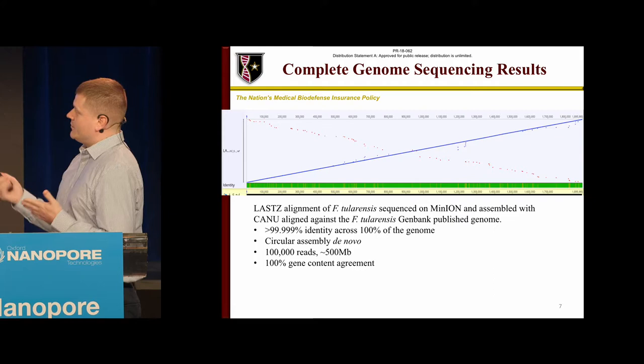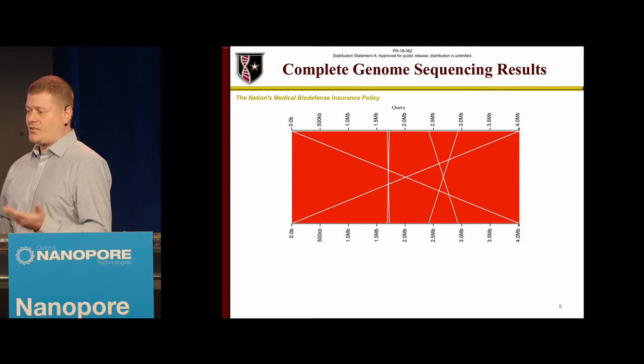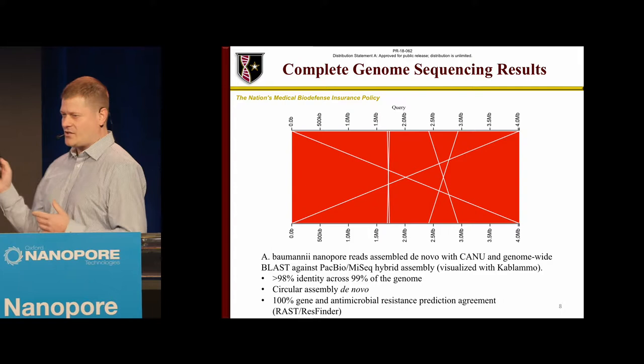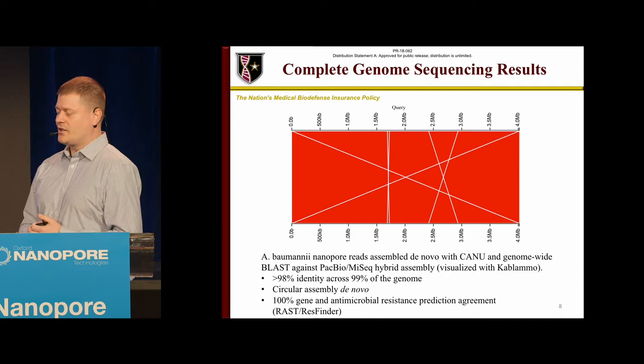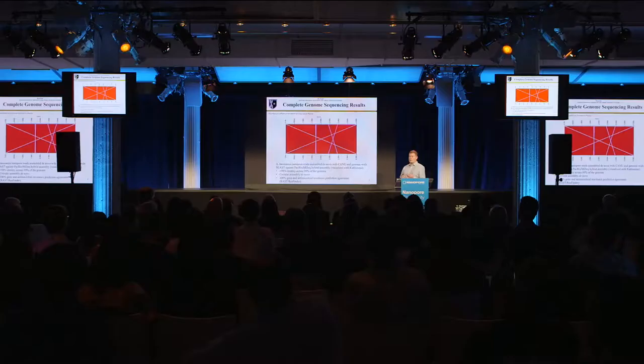This is the Francisella against the GenBank sequence. We found some SNPs and some small indels, but 100% of the gene content was in agreement. Essentially the same thing for the baumannii against our PacBio assembly. Those differences look bigger than they actually are, it's the Kablammo visualization. Only a few indels and small differences here and there, but the overall structure and complete gene content, as well as the antibiotic resistance, because this was a clinical isolate, did agree between the two as well as with the phenotypic profiles.